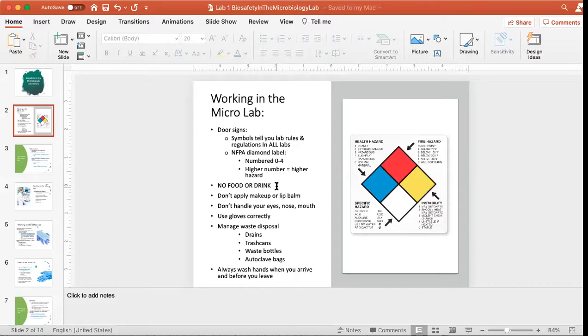It's not considered good laboratory hygiene or good practice in a laboratory to eat or drink. And that's because there are chemicals and agents and cells inside of labs that can harm us. So it would be a terrible idea to consume something that might be contaminated. So we just don't do it. We set aside other spaces at work where we can eat and drink.